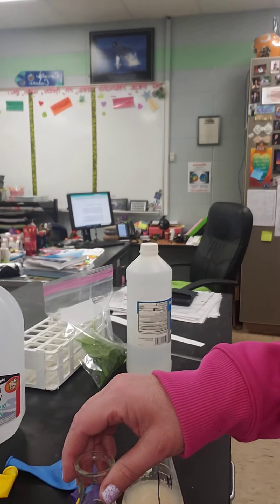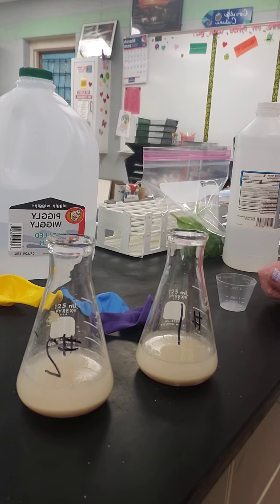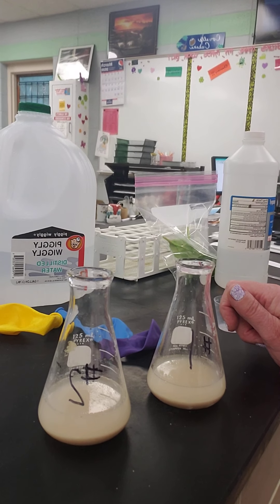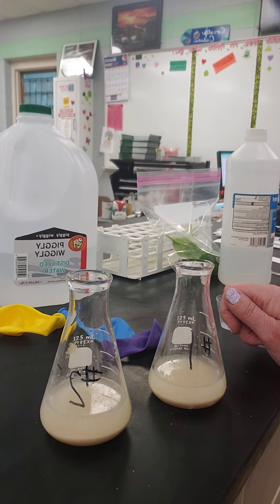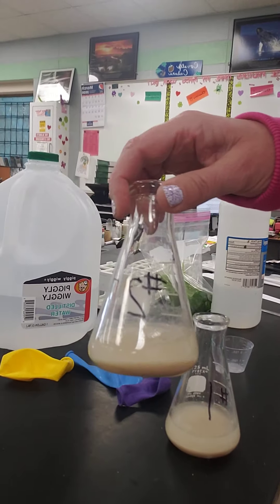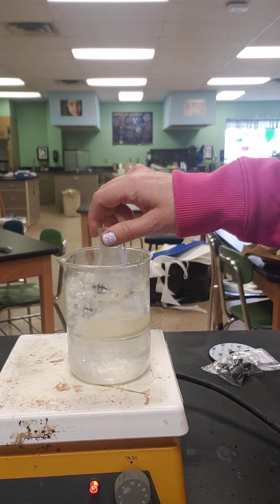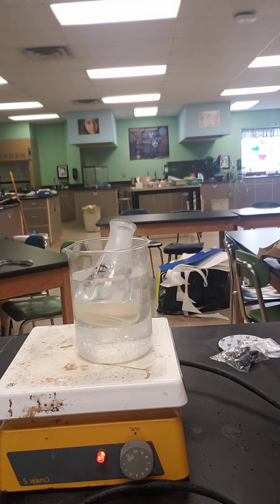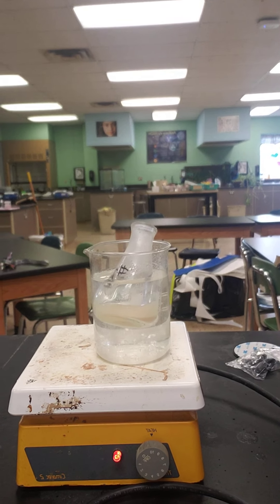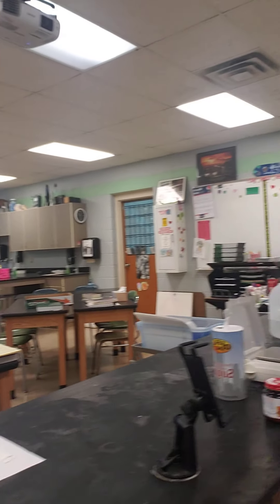Flasks one and two are exactly the same — they both have 50 milliliters of distilled water, two grams of yeast, and two grams of sugar. Now flask two I'm going to put into some boiling water for about two minutes. While that's sitting in the boiling water, I'm going to come over here.